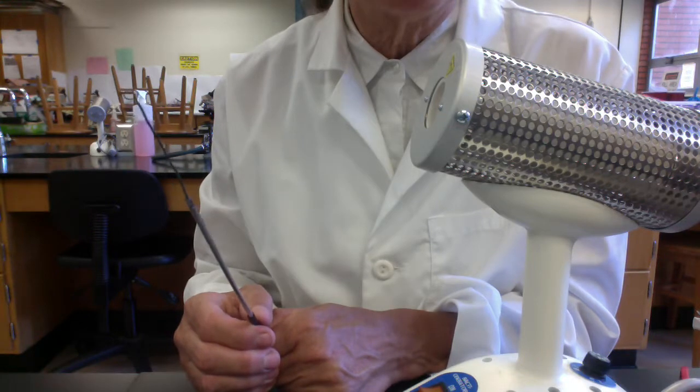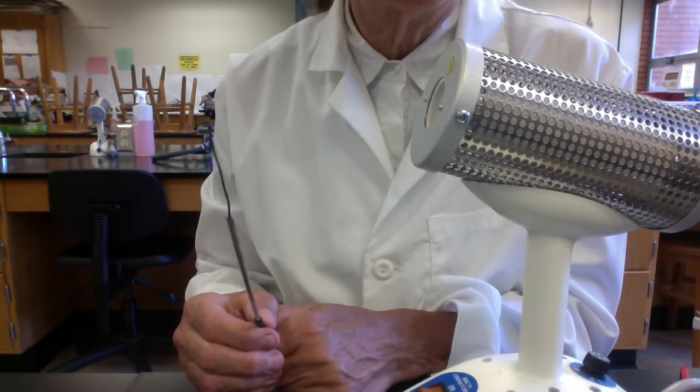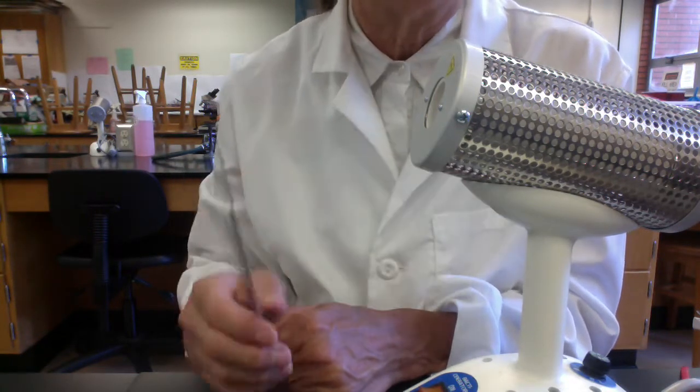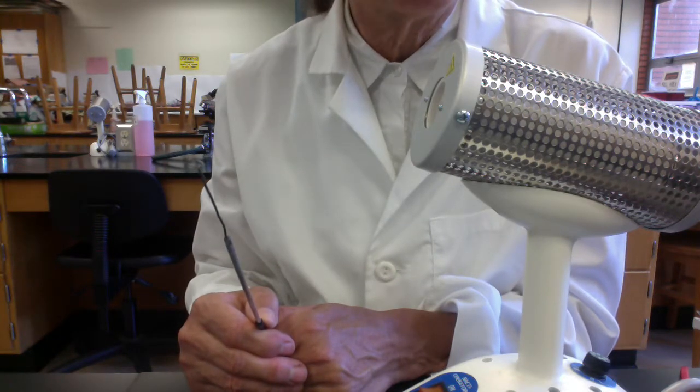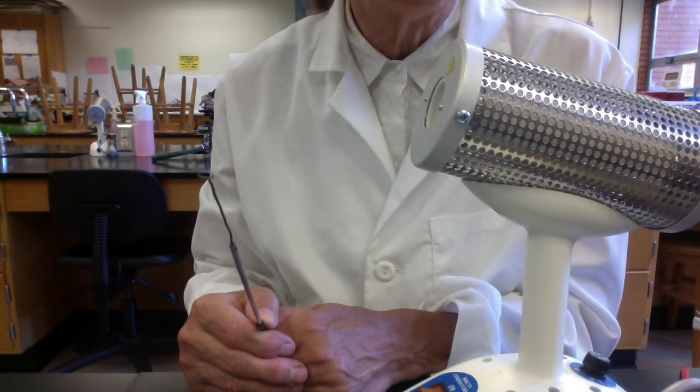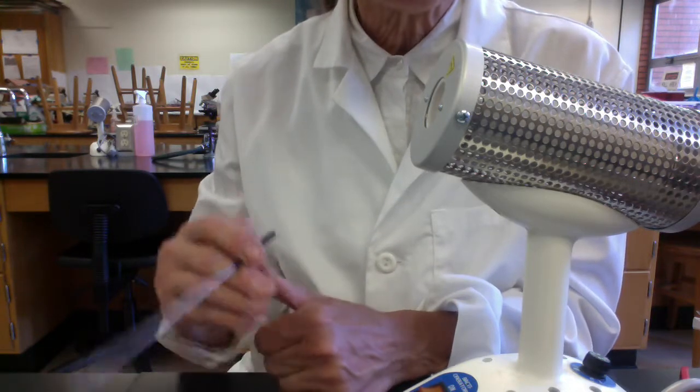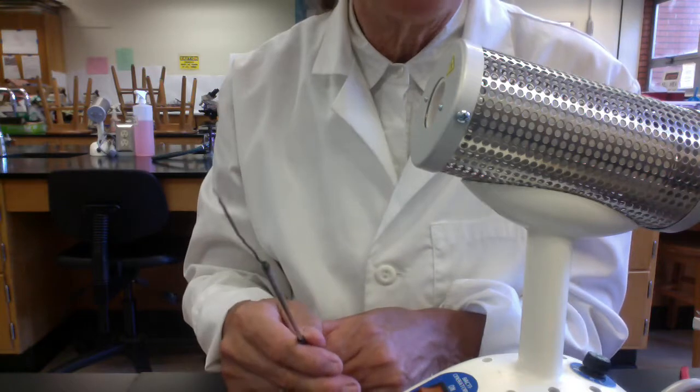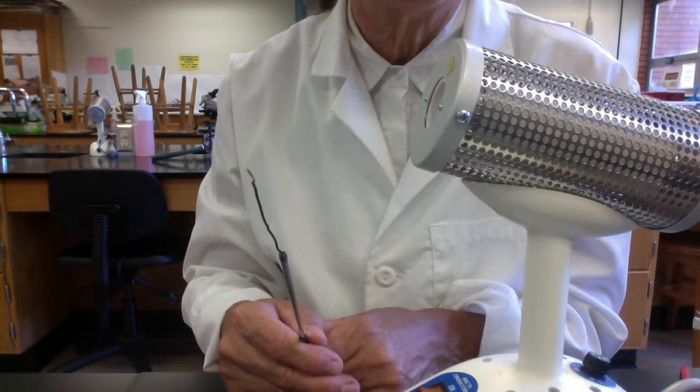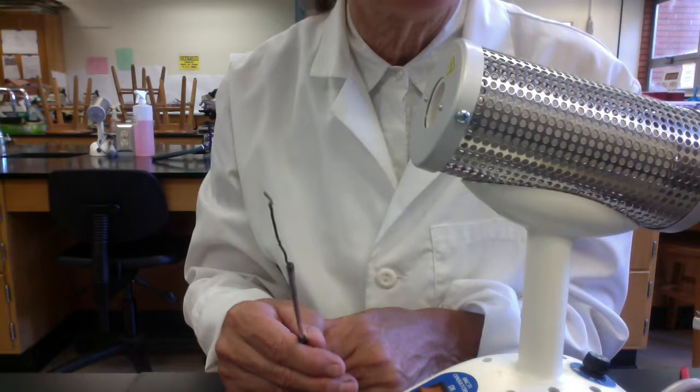Do remember even after turning off the Bacti incinerator, the barrel remains hot for a long period of time. So again, try to make sure that you don't touch it. Also make sure after sterilizing your loop, don't lay the loop on paper. We had a fire start when a hot loop was placed on a paper towel. It actually started a fire.